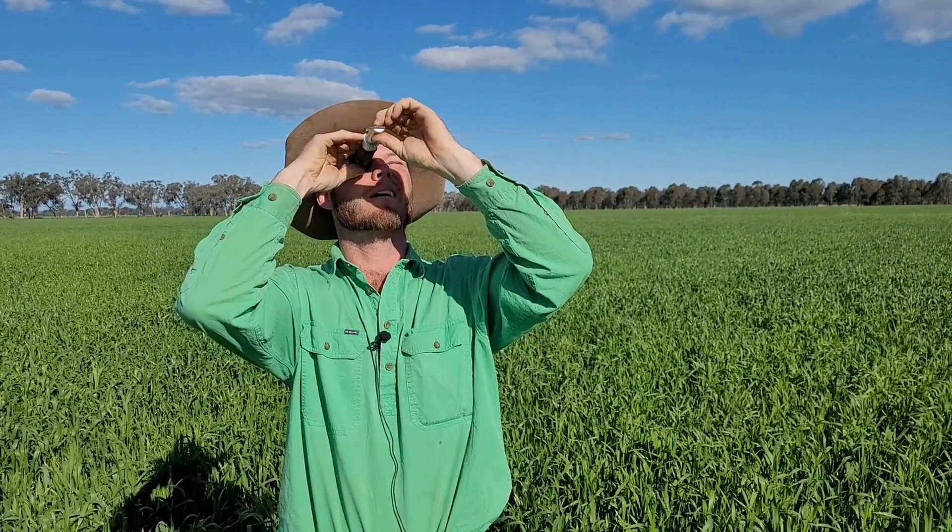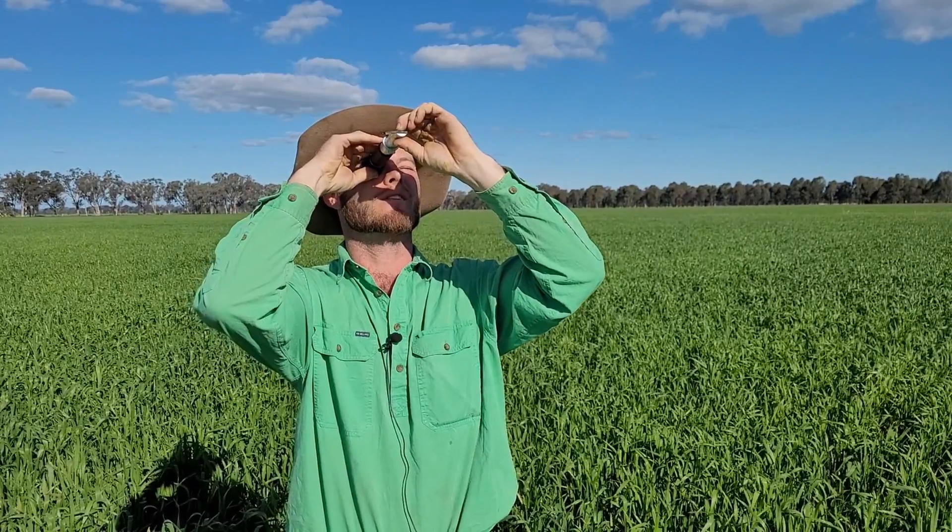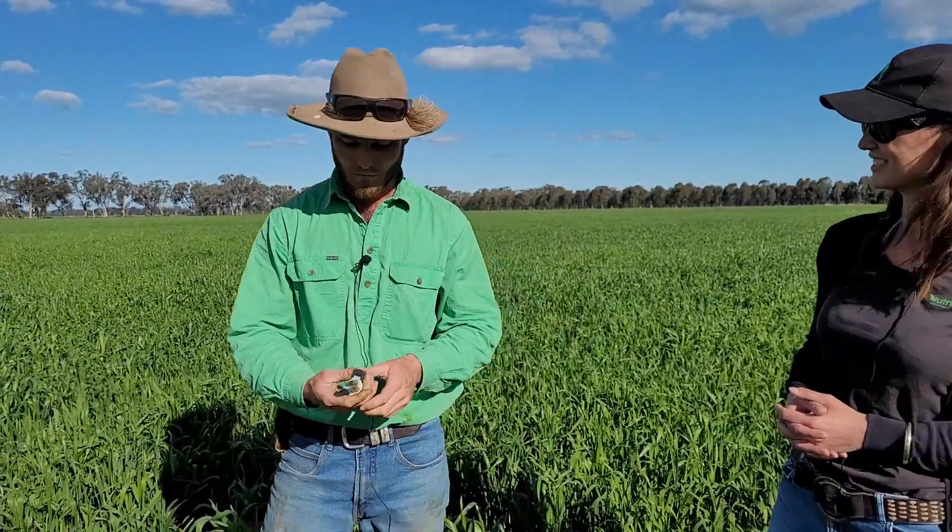And that's showing about twelve and a half and a pretty fuzzy line. A fuzzy line will indicate that we've got pretty good calcium in the plant. Be pretty happy with that at this stage. Crop looks good and soon to get some folias.